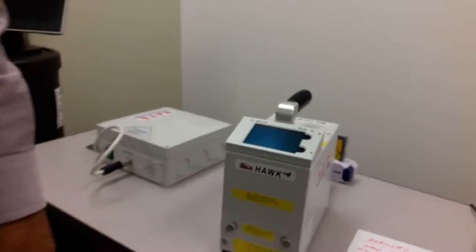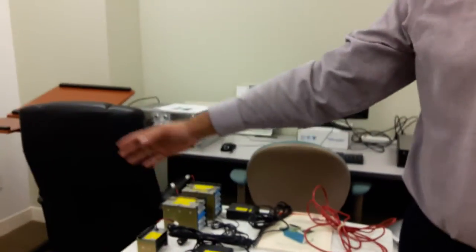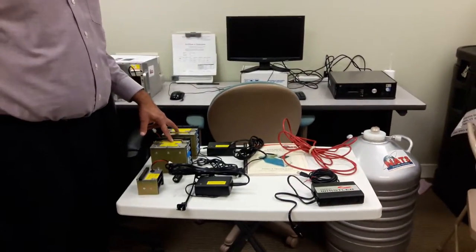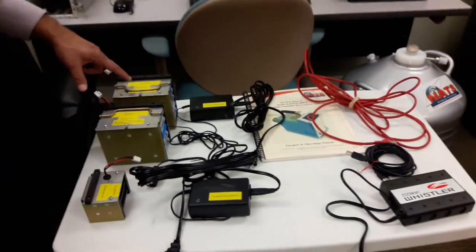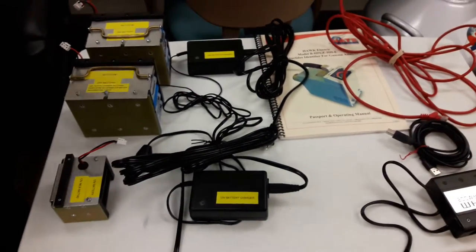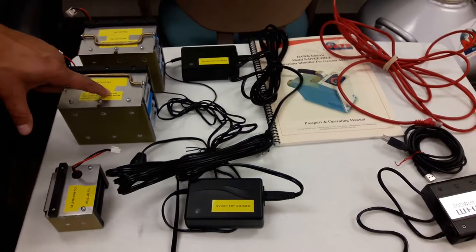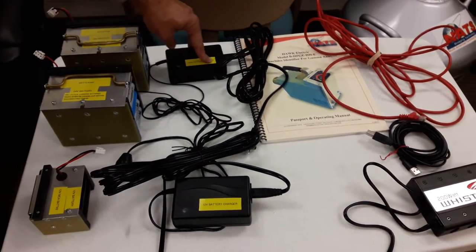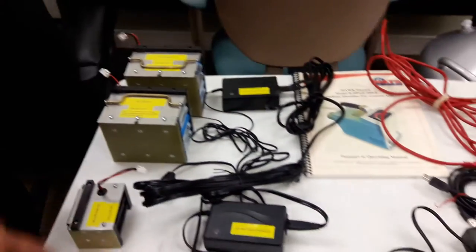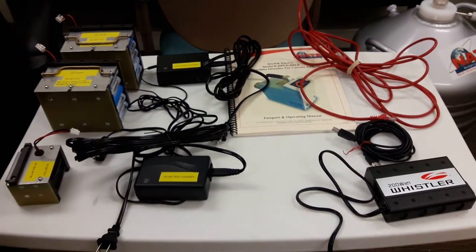Now I want to give you an overview of what's included. It comes with a Pelican box which carries everything inside. What we are offering you is one detector inside, two spare batteries for the cryo cooler labeled battery one and three — number two is inside right now — and it says 24-volt battery. It comes with a battery charger for 24 volts, and then you have a second MCA battery for 12 volts; one is internal and the second battery is here.